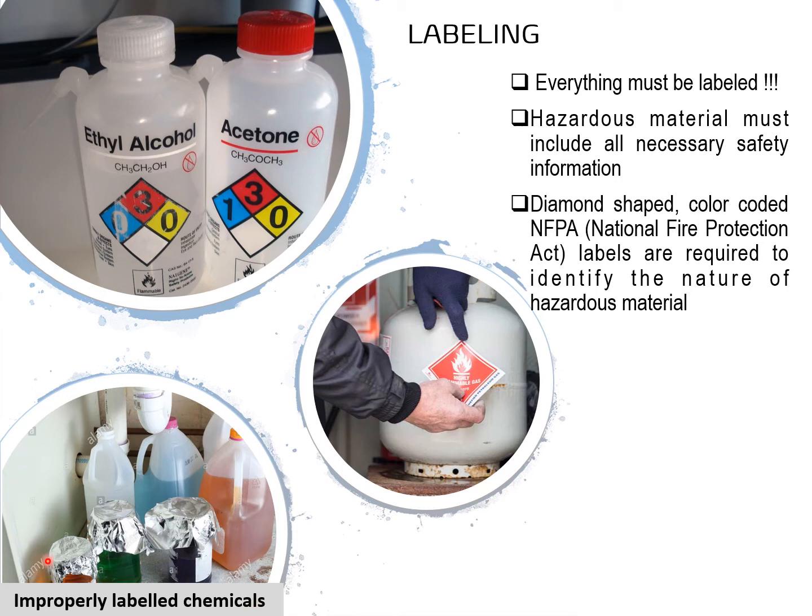So in this corner here, we can see a photo of improperly labeled chemicals. These are very dangerous chemicals when placed inside a laboratory because they don't have any names, and if they don't have any names, we do not know the nature of this chemical. It may be flammable, it may be corrosive, it can be an irritant.